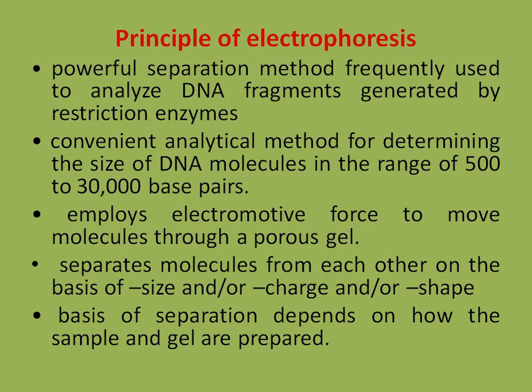So electrophoresis separates the molecules according to their size, charge and shape. According to these three conditions, the molecules are separated.